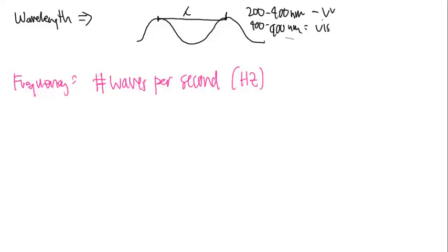All right. When we talk about infrared spectroscopy, in UV, we talk about nanometers, right? That was the unit that we kept giving it. But in the infrared world, what you're going to find out is that we're not going to use nanometers really. We dial the machine into a different unit. And the reason I will tell you later.